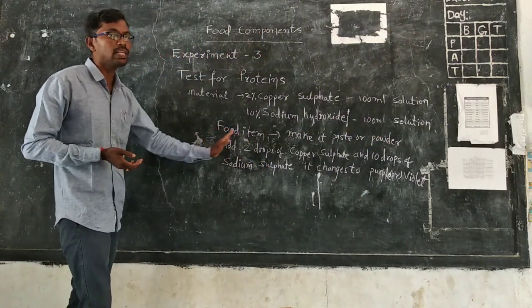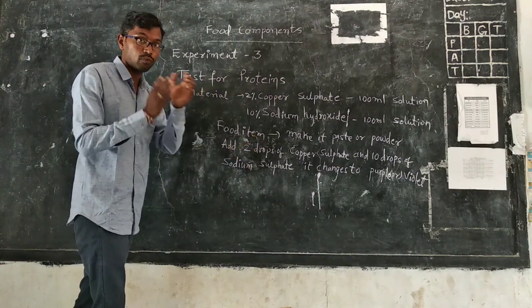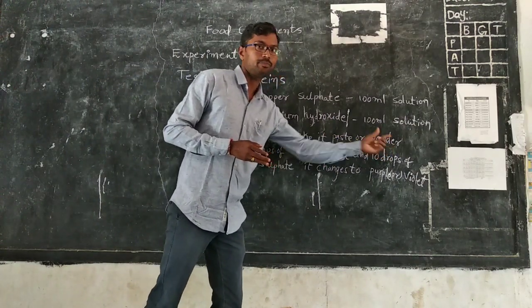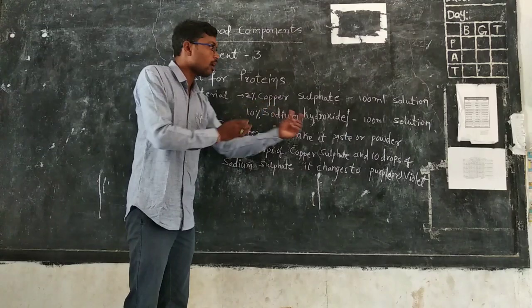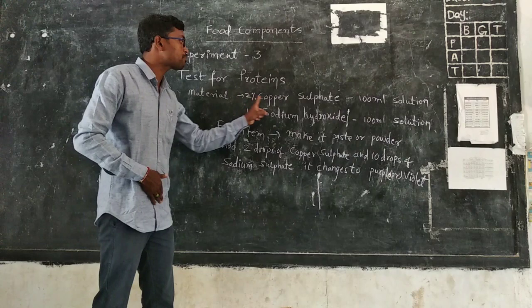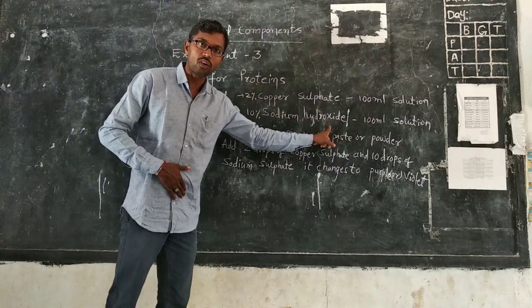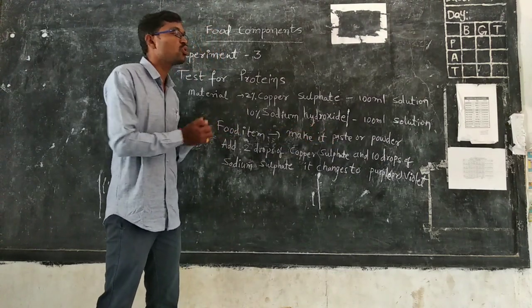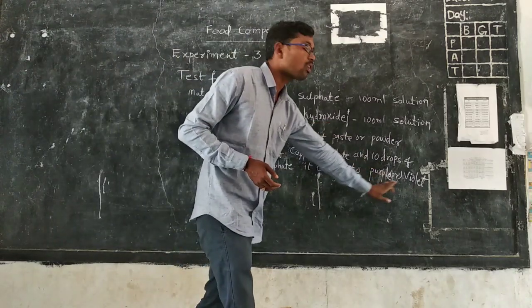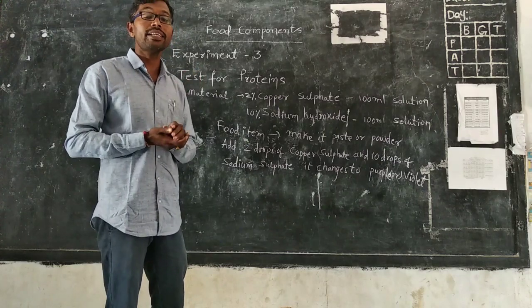Now take any one food item for this test. Take the food substance, make it into a paste or powder, then put this paste or powder into a test tube. Add two drops of copper sulfate and ten drops of sodium hydroxide. When we add this solution to the food item, it changes to purple or violet color, which confirms that proteins are present in the food item.